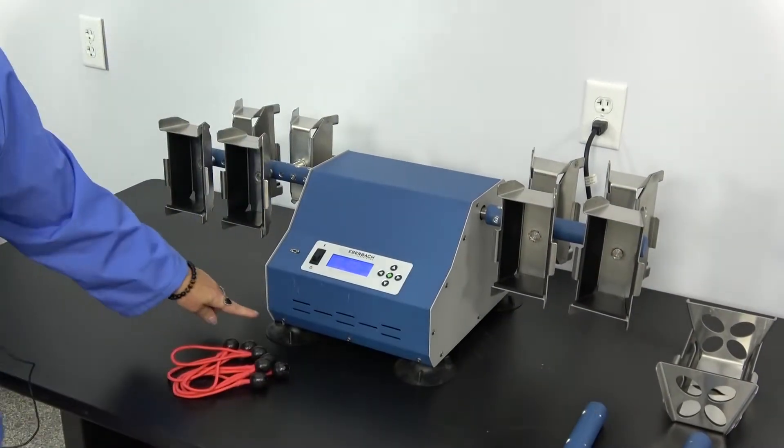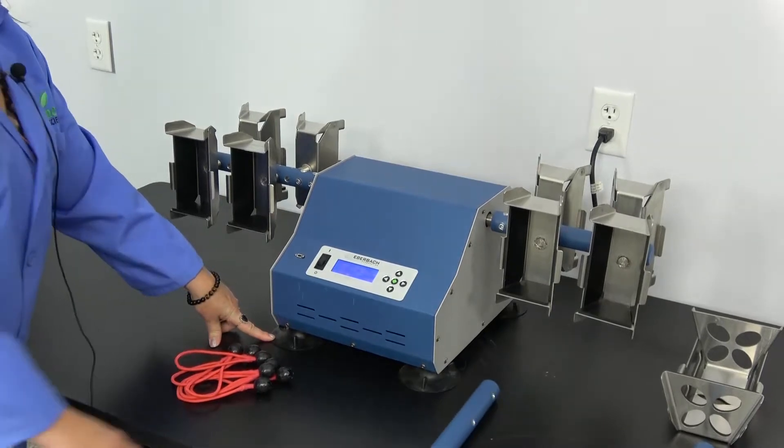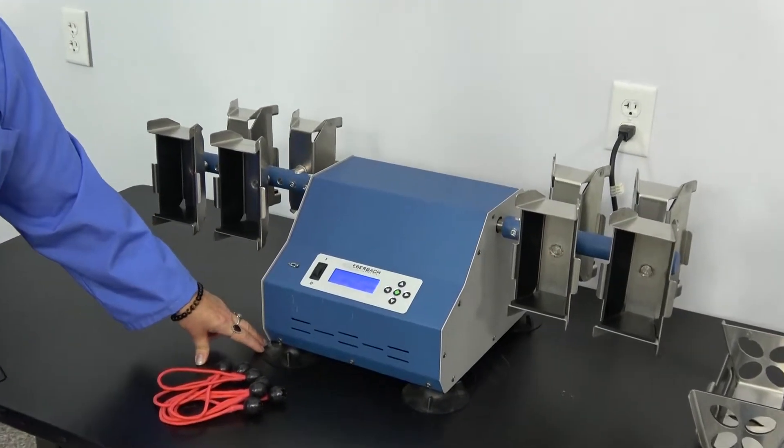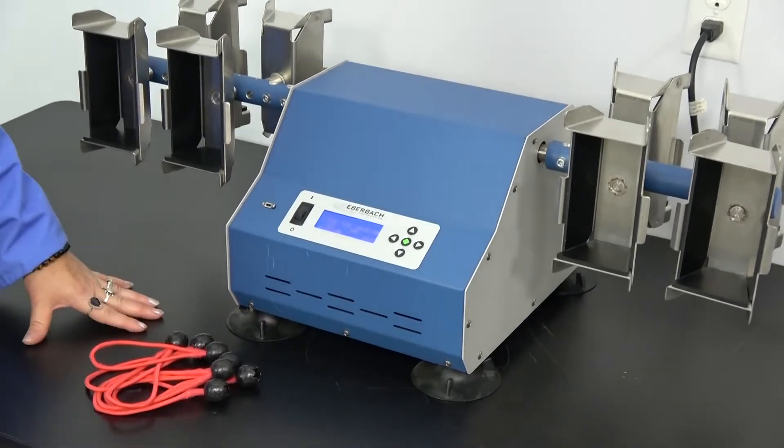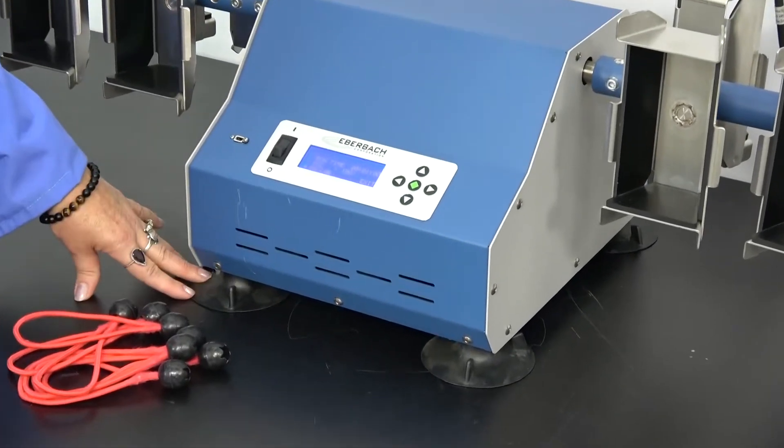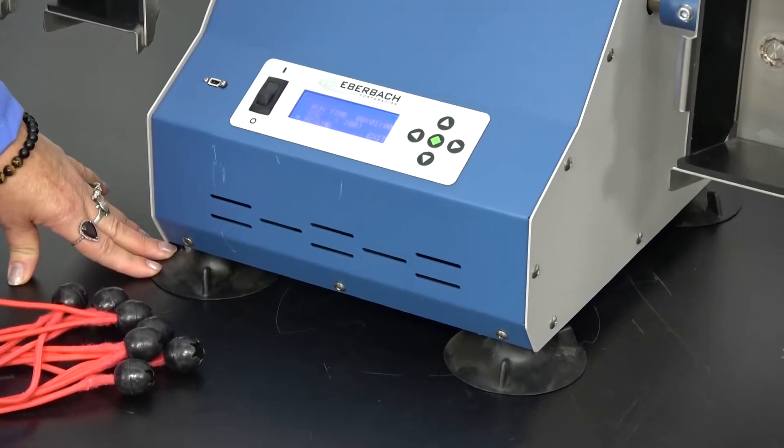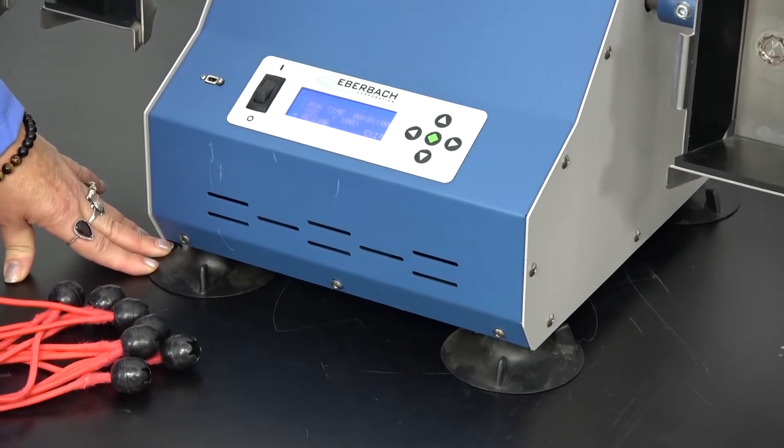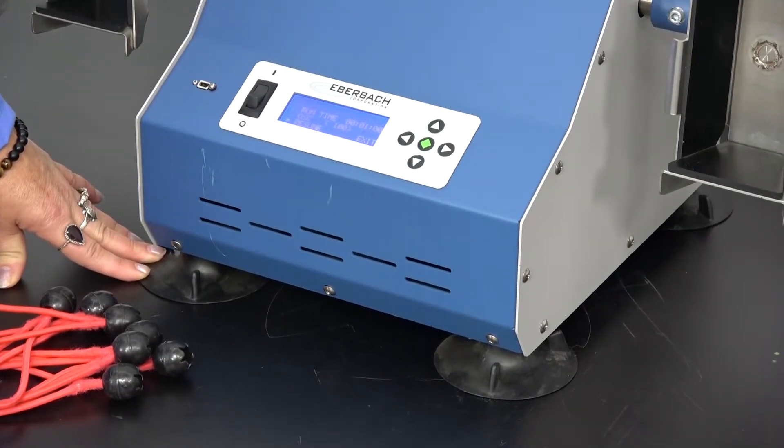The shaker features rubber feet. This makes the benchtop unit stable during the shaking procedure and it doesn't make the counter jiggle. The unit is capable of handling up to 10 pounds of load—that would be your containers plus your samples.